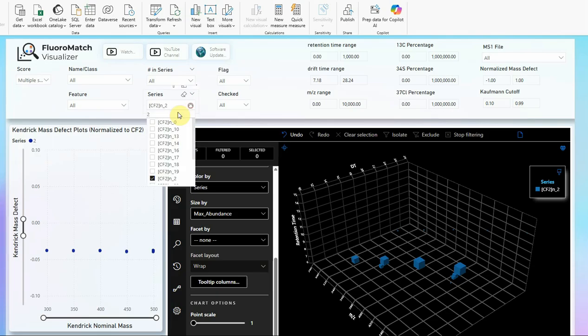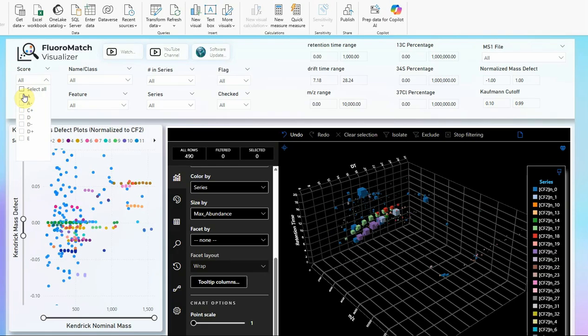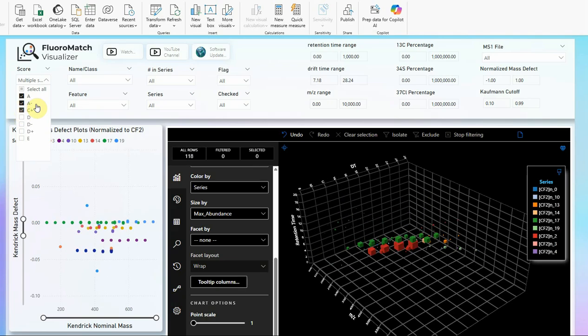Now the data set begins with filters just on score. So it already has these preset filters, so if you want to see a feature and it's not showing up, make sure to deselect these filters. A and A minus are CCS matches. C plus are those that fall in series with A or A minus. And then there's also B and B plus, not shown here, but B plus is also a CCS match, but it's to a predicted library rather than an experimental or standard-based library.